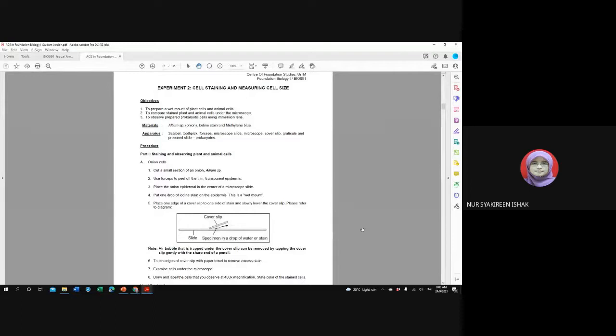Assalamualaikum. Basically, okay. So for our lab session today, I hope it should not take too long, although we are going to cover two experiments. So for today, we are going to look at experiment 2 and also experiment 3. Okay, so for experiment 2, we are going to look at a video demonstration, a lab demonstration of cell staining.